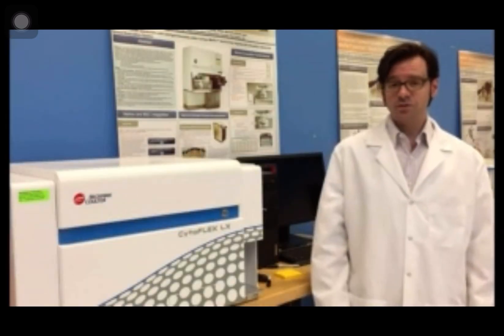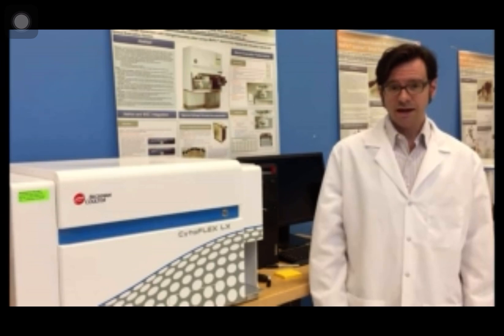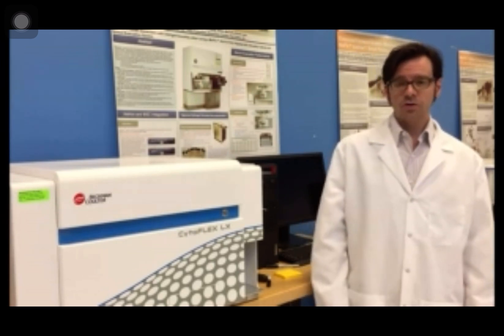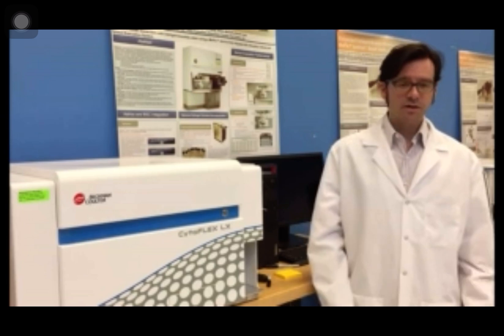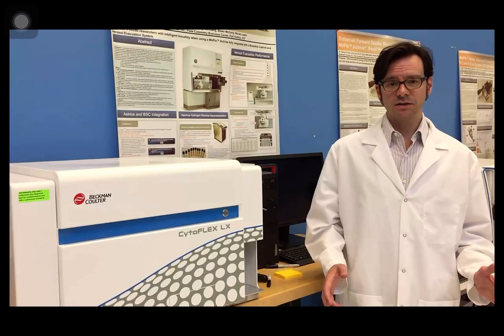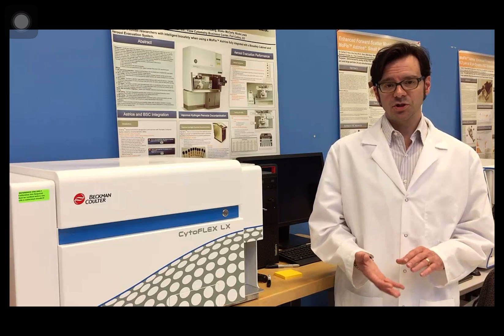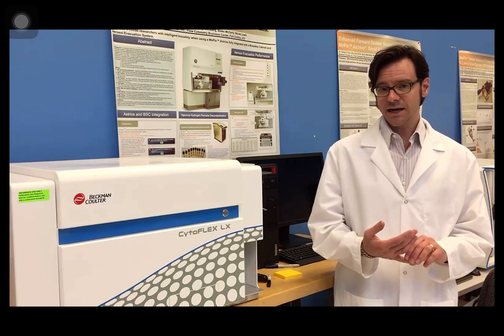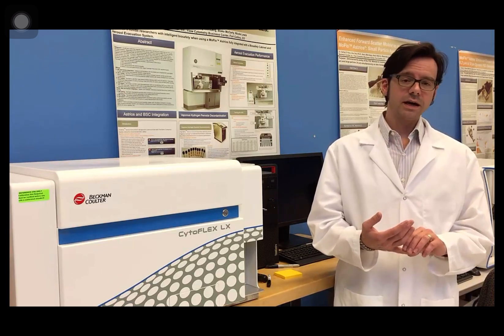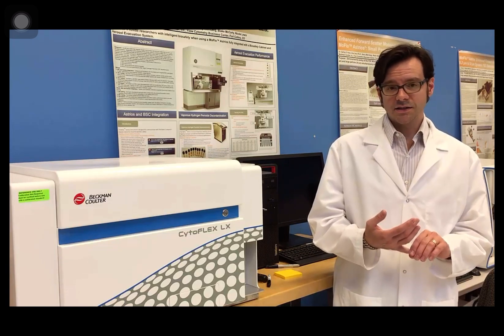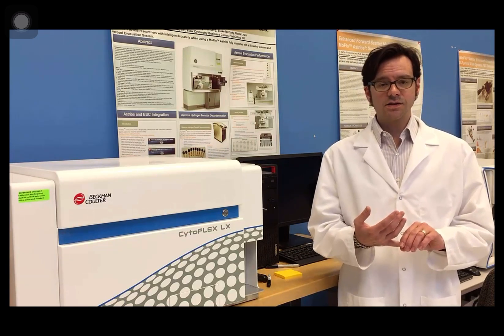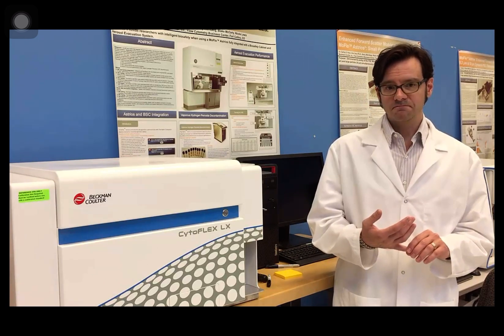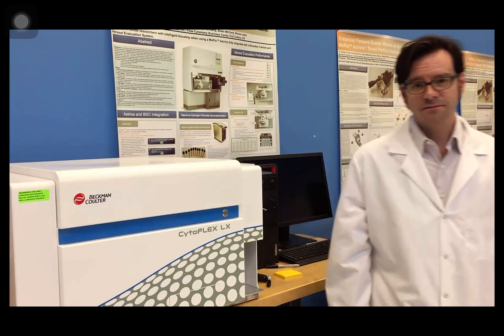Hello everyone and welcome to Beckman Coulter's Northern Colorado Training Lab. I'm Dr. James McCracken and today we're going to be using my CytoFlex LX to look at the start and end process of how we set up a new experiment in CytoExpert. You're going to be using a DuraClone 10 color T cell subset assay and in the process we'll learn how to draw gates and regions and how to get statistics, how to adjust gains, how to do compensation on a 10 color experiment. All right let's get to work.